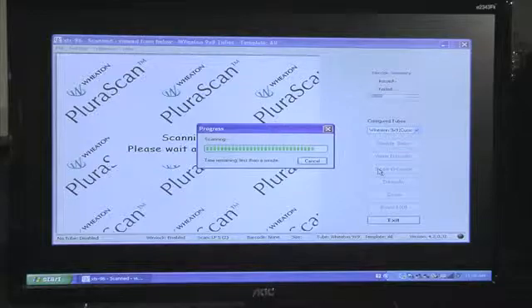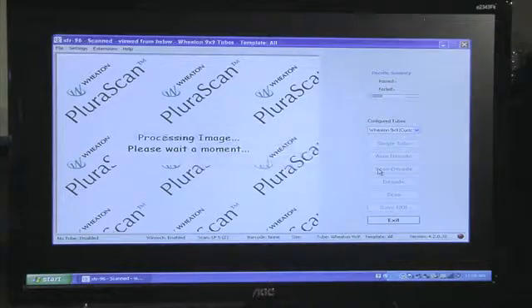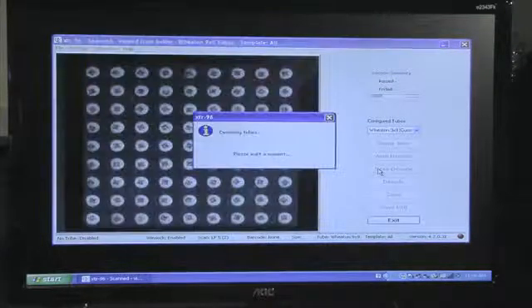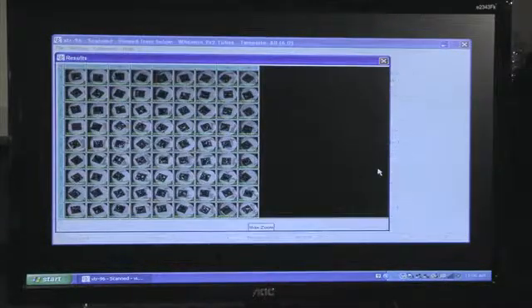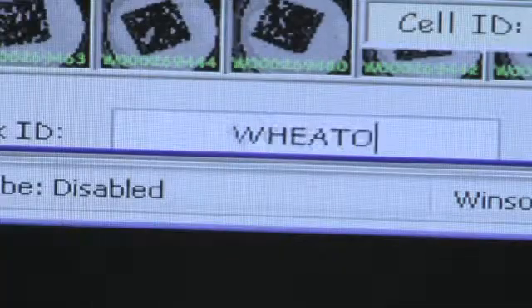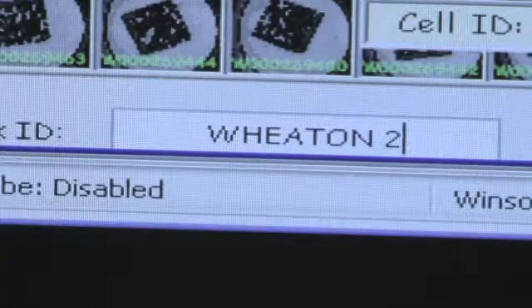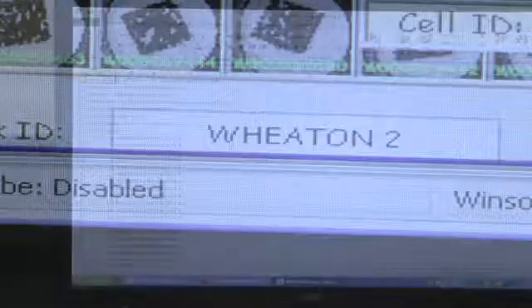The scanner will then perform a far more detailed scan as the final scan. If necessary, use the dialog box to define your rack layout.